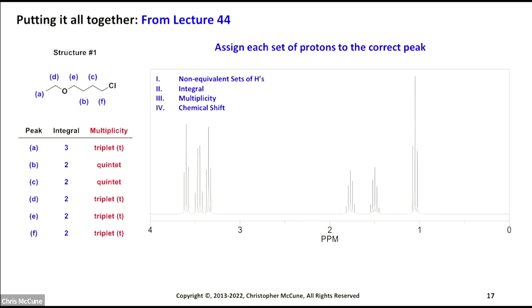We can see peak A. We're going to call this A. Typically, you always go from right to left, B, C, D, E, if I did this right, which I didn't. So what did I do here? Okay, I already labeled the structure. So let's label the peaks now. Okay, so A is a triplet. And so you have triplets in 3 different places. So we have triplets, one here, here's a triplet, and here's a triplet.